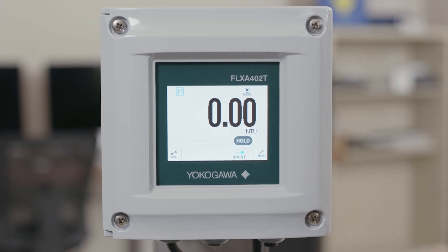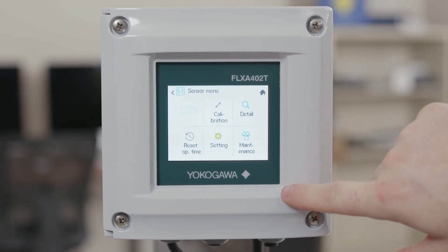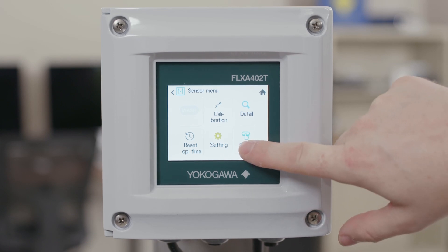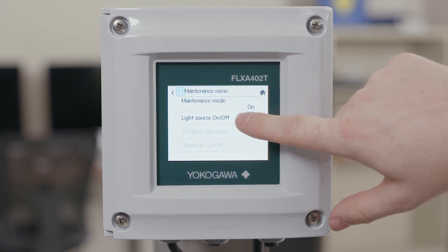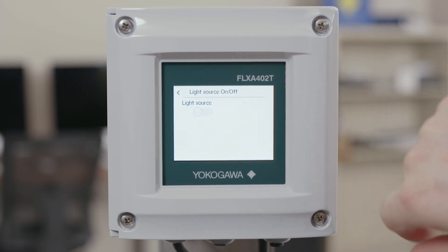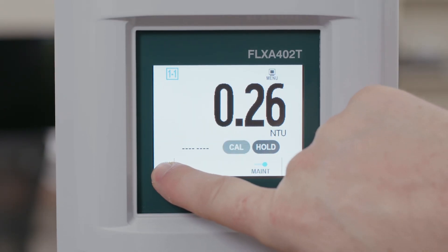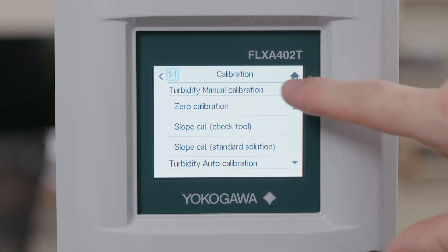If you're doing a zero water calibration, make sure that your light source is on. If you have turned the light source off, go back into the sensor menu, into maintenance, and the light source on/off, and turn the light source back on. Once we've done that we can go back to the home screen, click on calibration, and do the same as before — go to zero calibration.